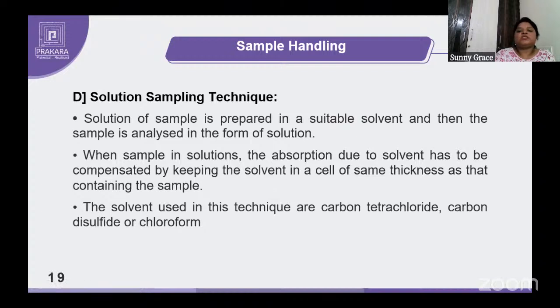So these are all the different sampling techniques for how you handle samples, whether solids, liquids, or gases, in IR spectra.